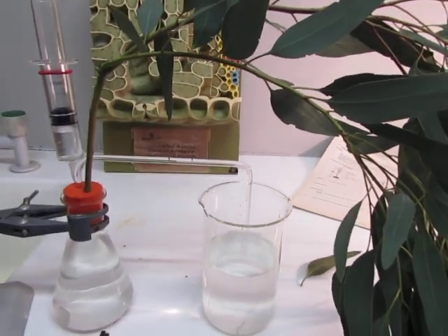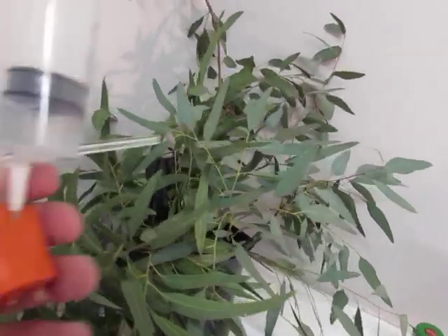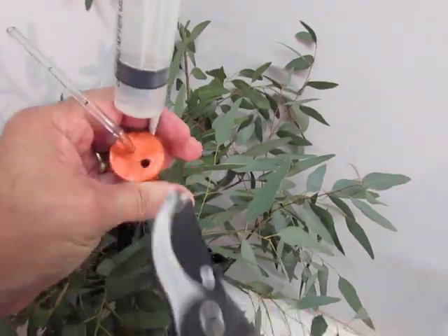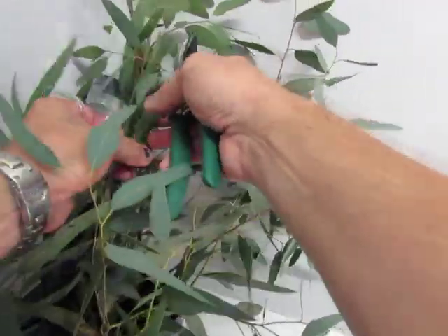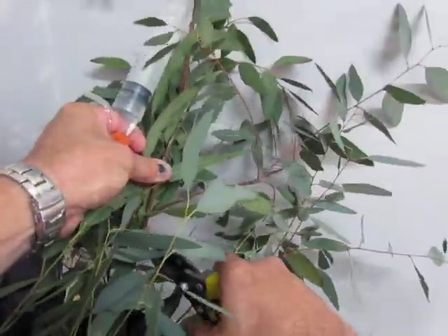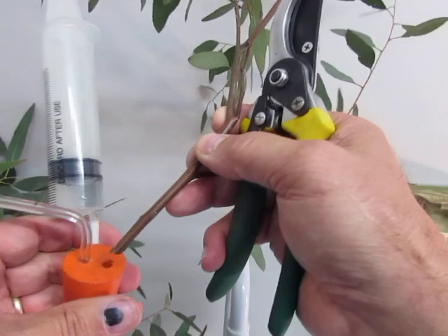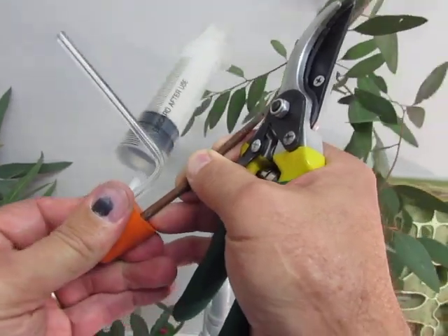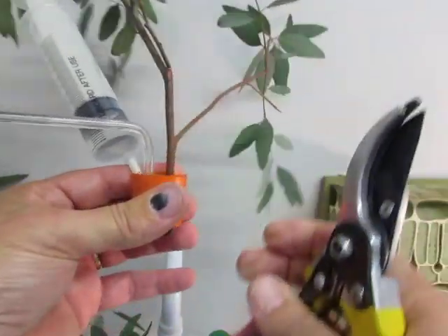But first of all, I'm going to show you how you use this pruner to cut a little branch of a blue gum tree. I found that the blue gum tree is the best tree to do this experiment with. So I look at the hole there and judge the size of the hole, and then I cut the branch there, and then very slowly I push this branch into this hole of the rubber stopper, and there you can see I've got it.